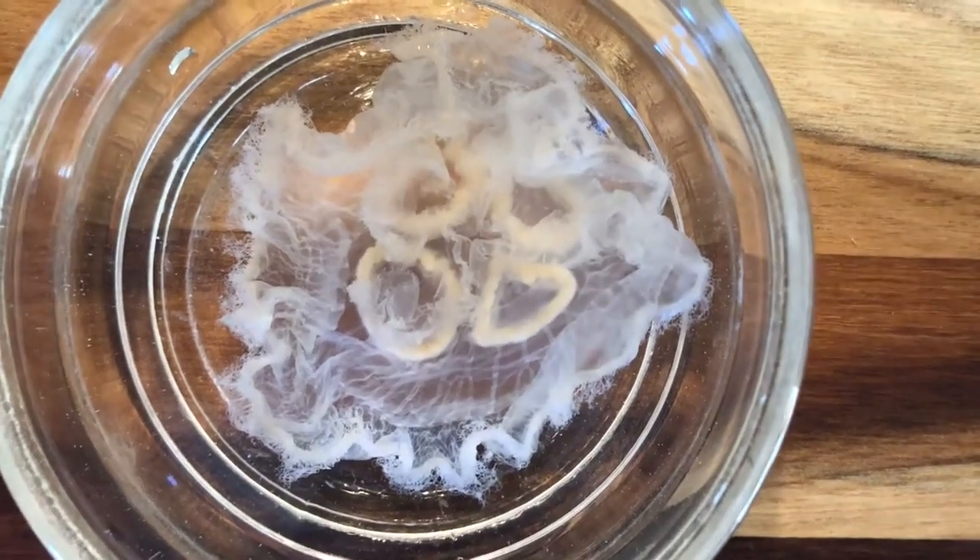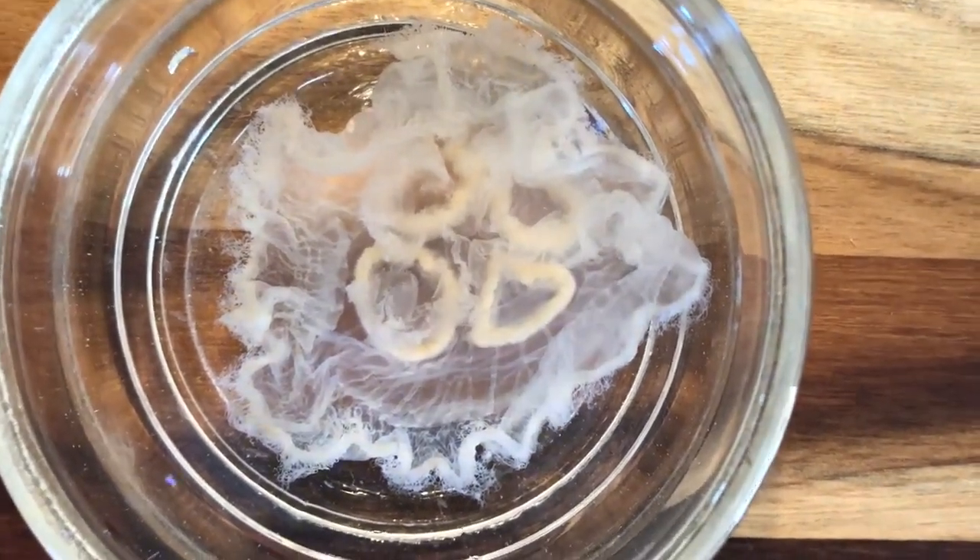This is the dissection of the Aurelia aurita jellyfish, also known as the moon jelly.